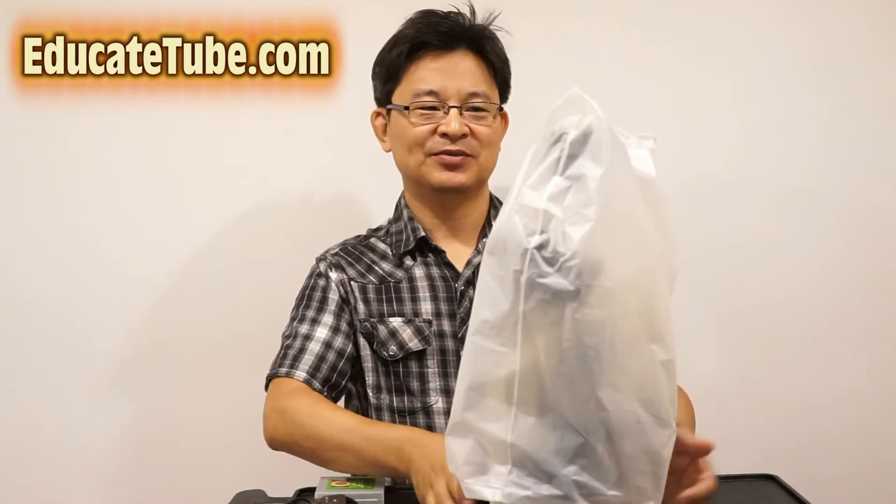Now let's do the opposite. Instead of zooming into the macro world, what about the micro world? Here we have a microscope — a very nice stereo microscope, in fact.